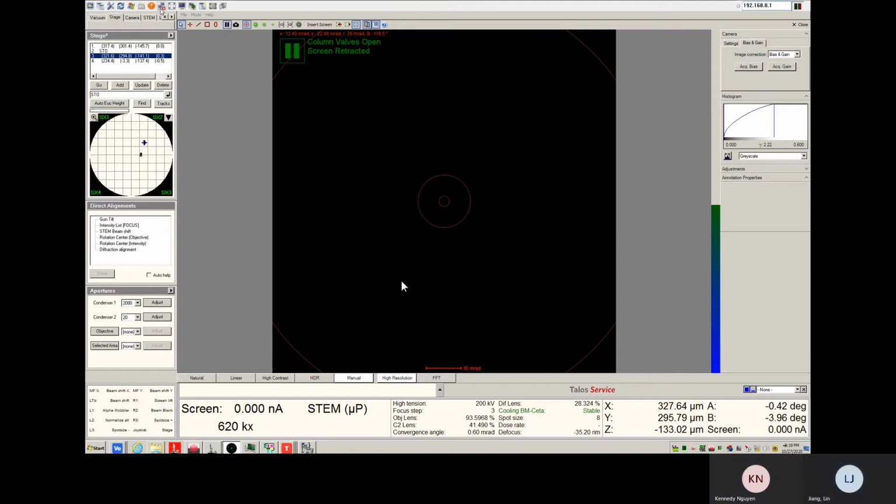Okay, right. So if you didn't take the STEM image, you could just slide through the diffraction patterns anyway. You mean the diffraction patterns? You could just do the slide number if I didn't take a spectrum image every single time I took the diffraction pattern.